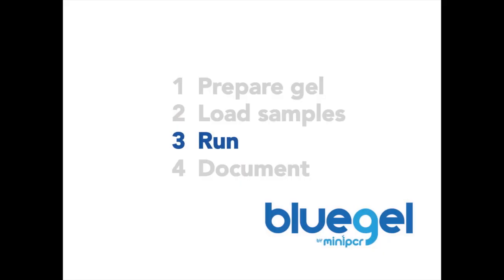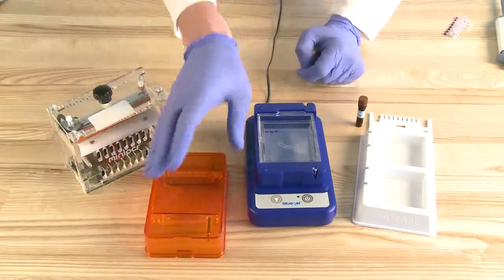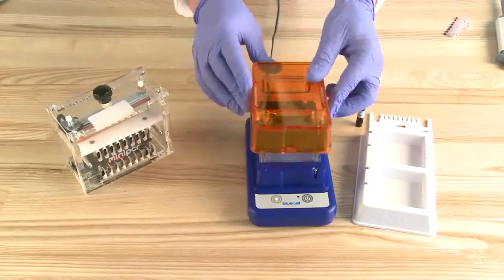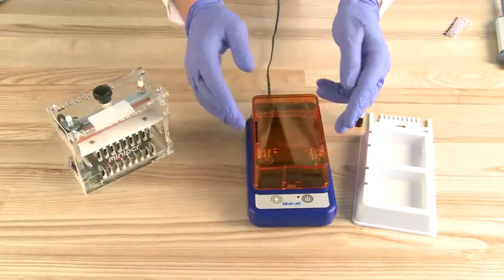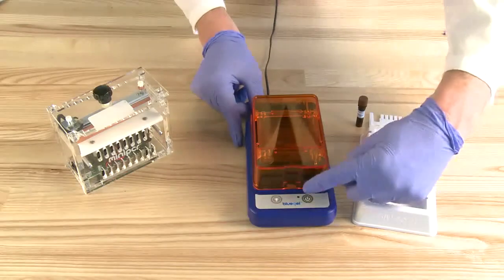Once you have loaded all your samples, place the orange cover over the blue base. The cover will only fit so that the electrodes are in the correct position. Start the electrophoresis process by pressing the power button. The indicator light should turn on.